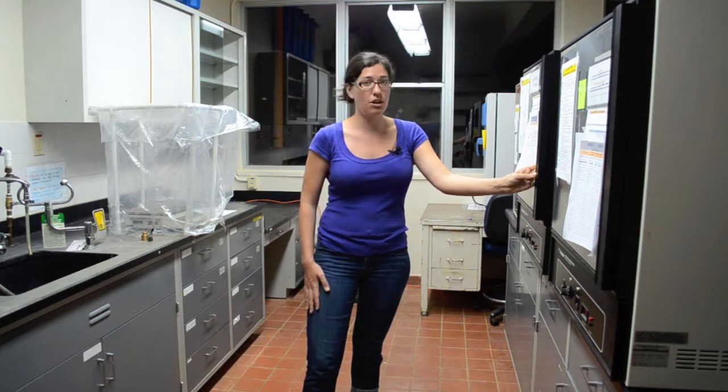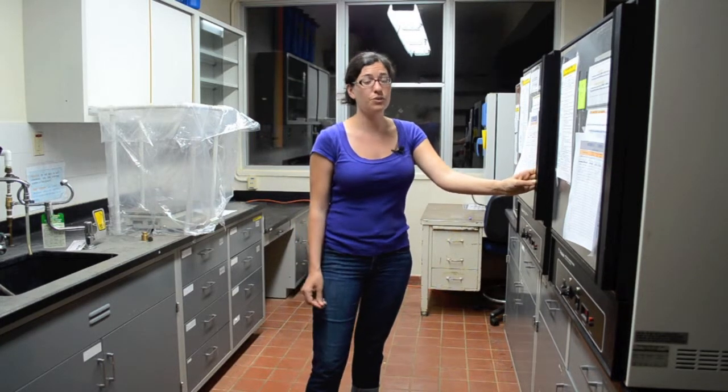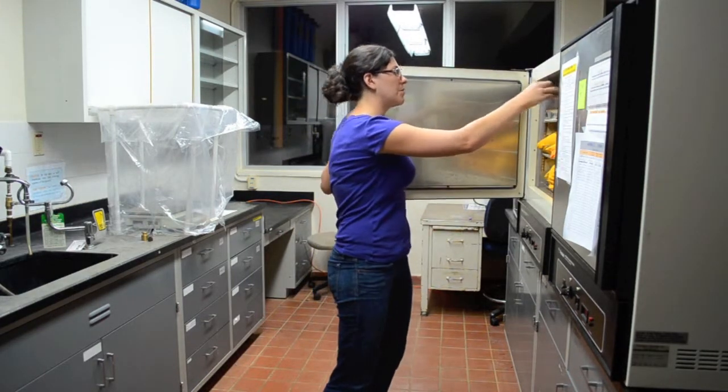Samples can take different amounts of time to dry — they don't always take the same amount of time in the oven. That's why we have to weigh them every day until they reach constant mass. For example, if there are seeds, fruits, or sticks in the sample, those could take longer to dry than just leaves.